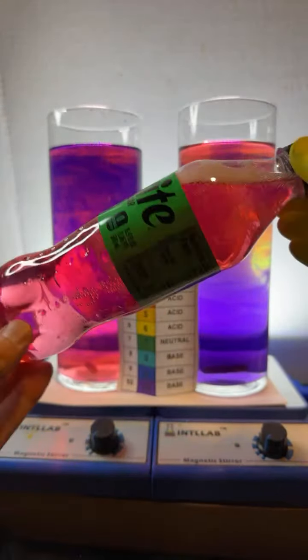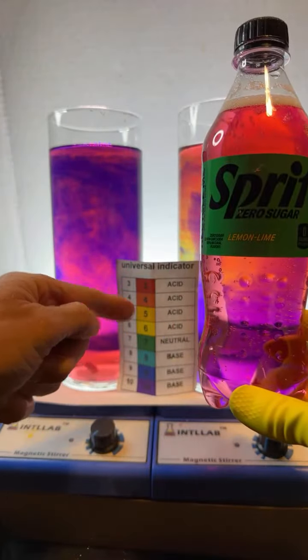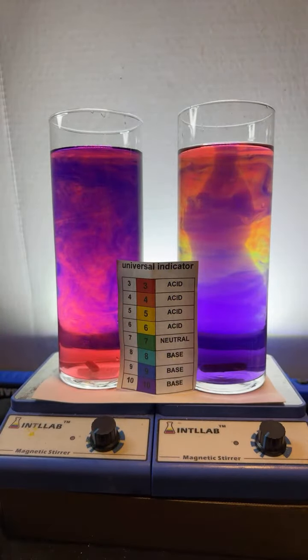So my universal indicator that I used here, we tested some Sprite, and we indeed showed that the Sprite is acidic. It's at least pH 3. It could be pH 2 or 1. The unfortunate thing about universal indicators, once you hit pH 3, it stays red all the way down.